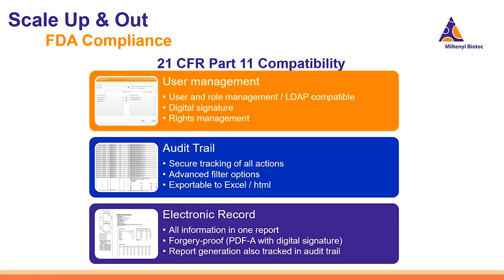Finally, depending on what kind of environment you're in, there might be some regulatory requirements, so you might want to consider FDA compliance in terms of 21 CFR Part 11 compatibility, in which they want to see some sort of user management, meaning user and role management with rights management and a digital signature for each data file. They also would like to see an audit trail that has secure tracking of all actions, that has exportable results and advanced filter options, and also an electronic record in which you can create a forgery-proof PDF/A with a digital signature that is digitally signed by the operator that is analyzing the data.